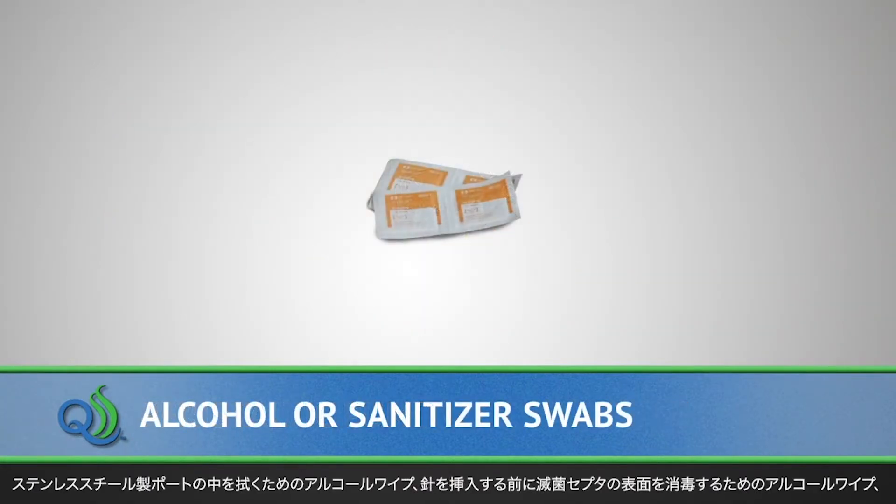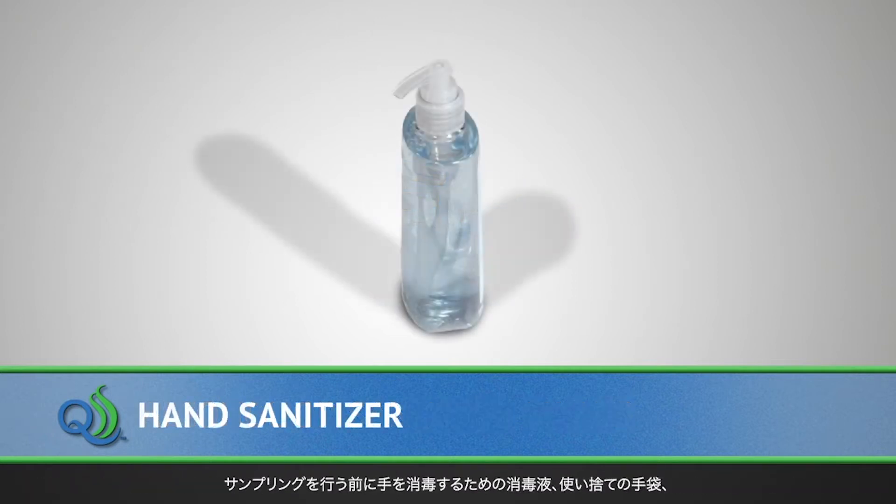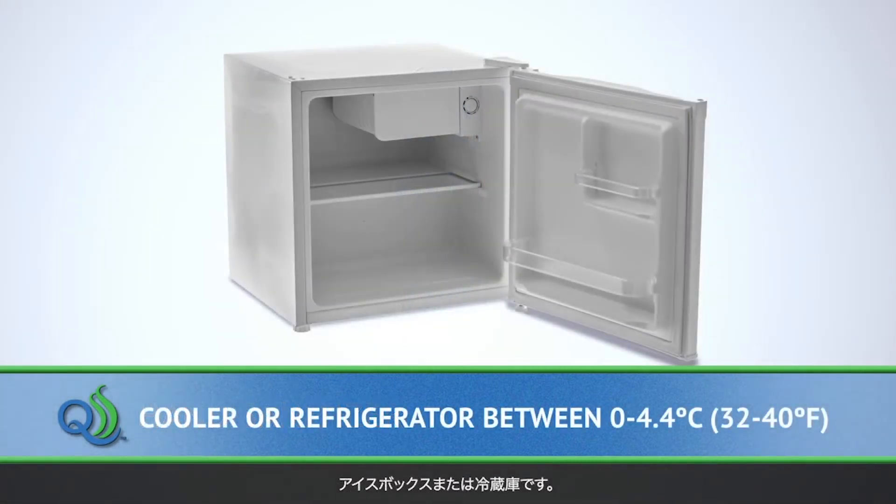Additional items include alcohol or sanitizer for swabbing the inside of the stainless steel ports and a separate swab for cleaning the surface of the QualiTrue sterile septum prior to needle insertion, hand sanitizer to clean hands before sampling, disposable gloves, and an ice chest or refrigerator.